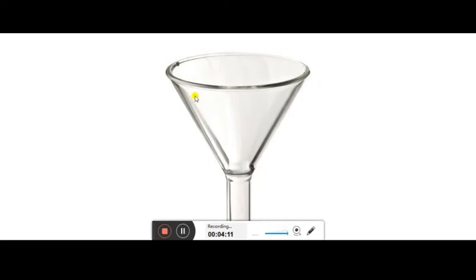This is a funnel. You might have seen a funnel in plastic material also, when kerosene is being poured into another container, so that the liquid should not spill. Here also the same work is there, for transferring liquid from one container to another, or for filtration. Filter paper is made into a cone form and placed here, and then the solid and liquid get separated. This is the funnel.